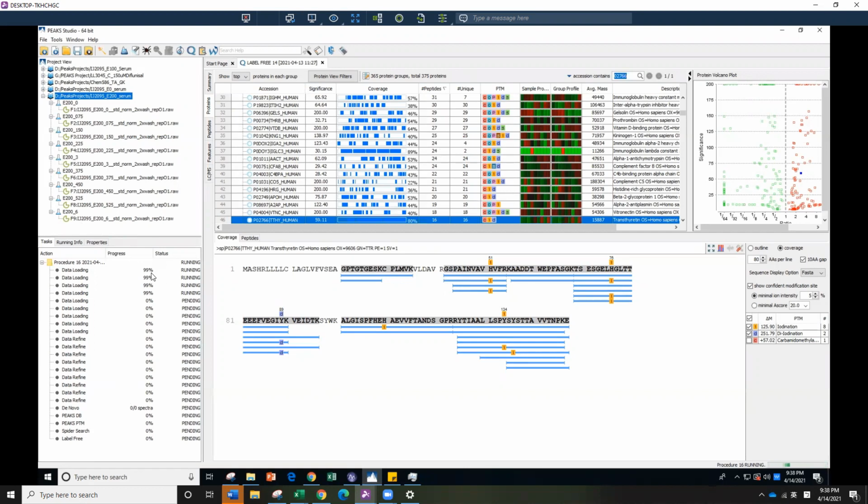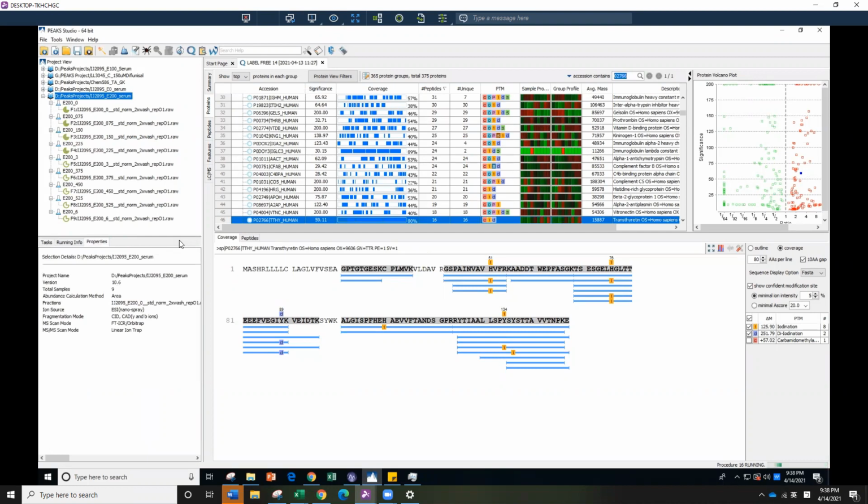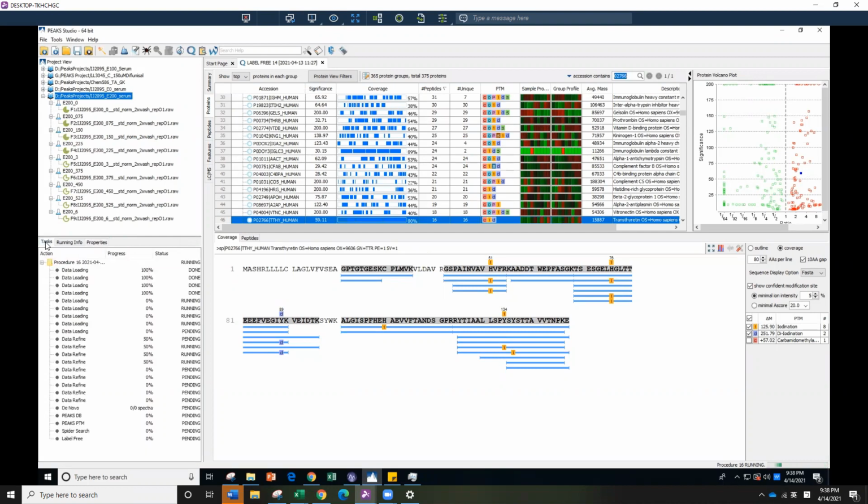Okay, it is 99%. After you queue up your samples, you really want to make sure everything reads in, so that you will not come back the next day and be disappointed that, oh shoot, it failed. When it's 100%, you will see a circle, and then it starts going to data refinement. Okay, so this is how you're going to set up your experiment.